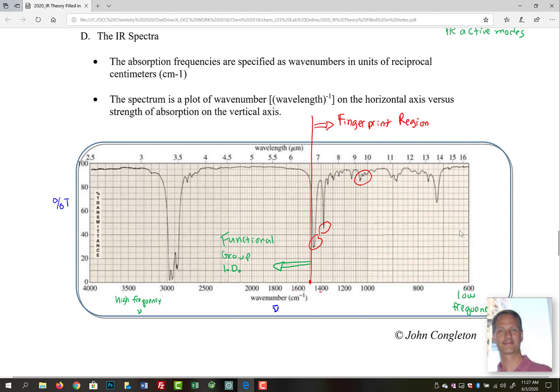Let's take a look at what we're going to be analyzing when we look at IR spectrum. We have wave numbers down here on our x-axis, and then we have percent transmittance over here on the y-axis. If we draw a line on our spectrum right here at about 1500 wave numbers, we can divide this into two sections. Over here on the right side, we call this area the fingerprint region. Just like your fingerprint is unique to you, the fingerprint region of particular compounds is unique to that compound. They match up peak to peak, intensity, pattern and everything. Over here on the left side, this is the business side of the spectrum for us. This is where we're going to be identifying functional groups. That's our key area for analysis when we start looking at spectra.